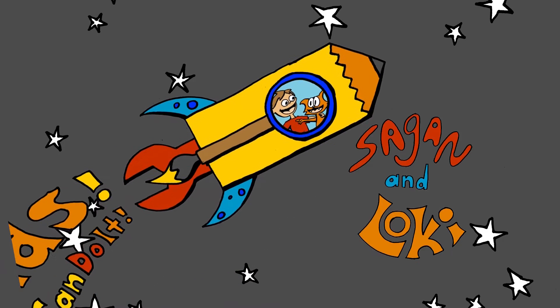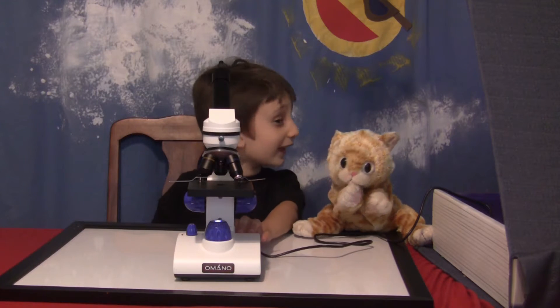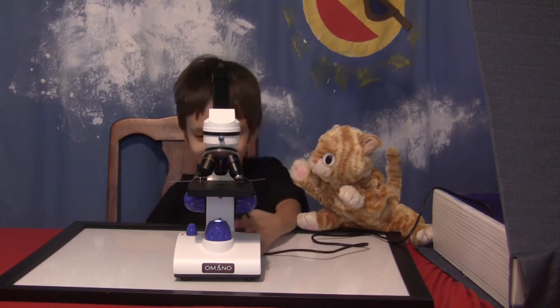We looked at a bunch of stuff under a microscope. Find out where it is! Next on Sagan and Loki. What's the magic book today, Loki? Well, of course it's going to be stuff to look at in a microscope.